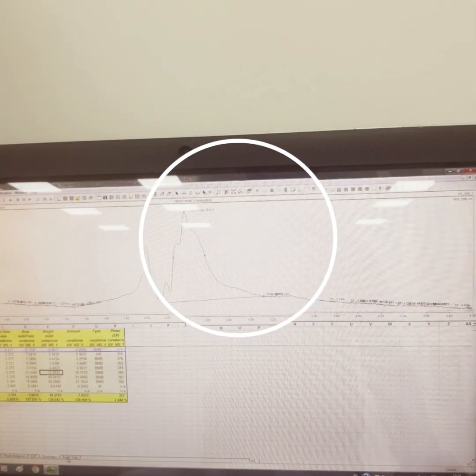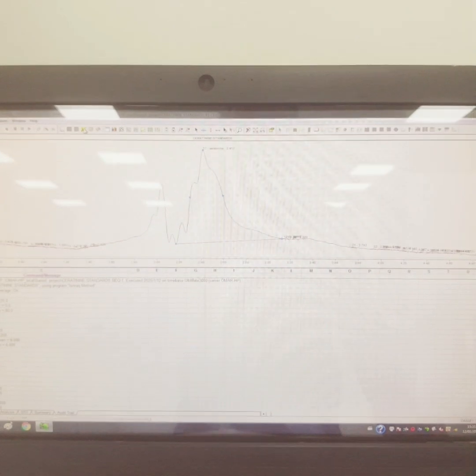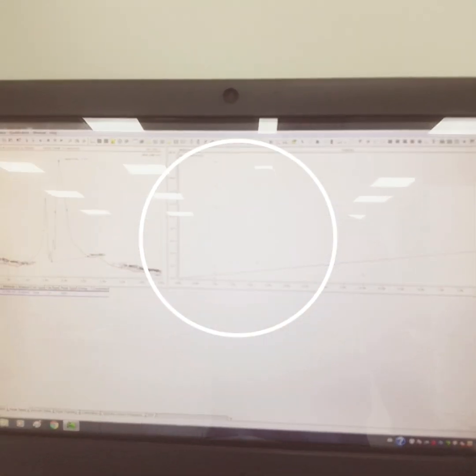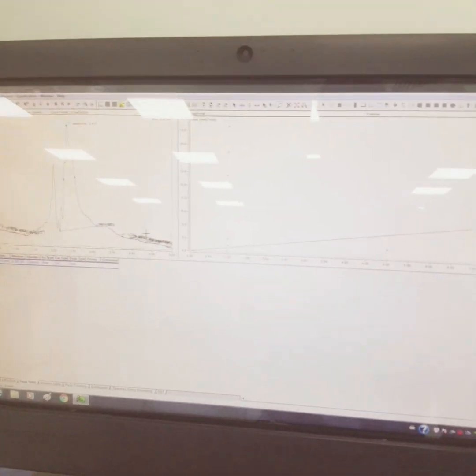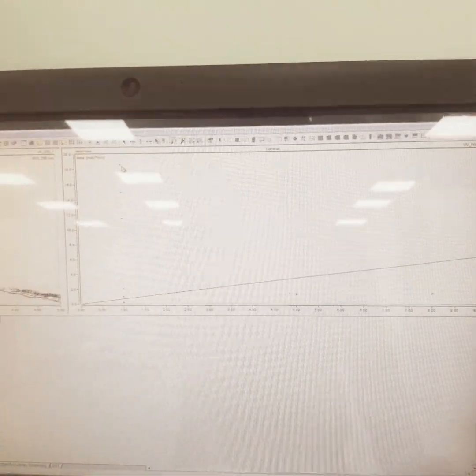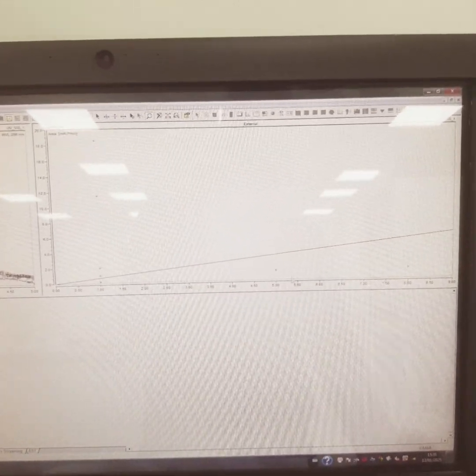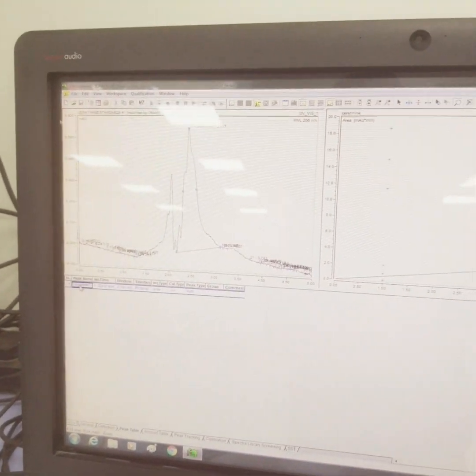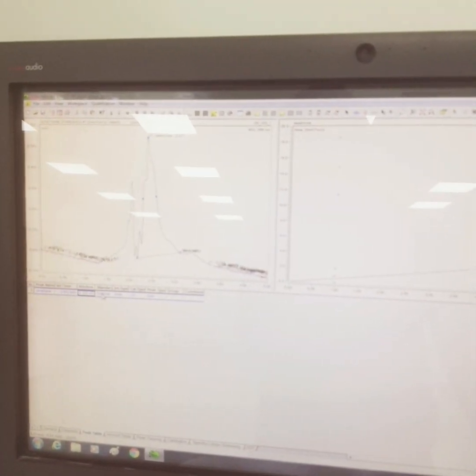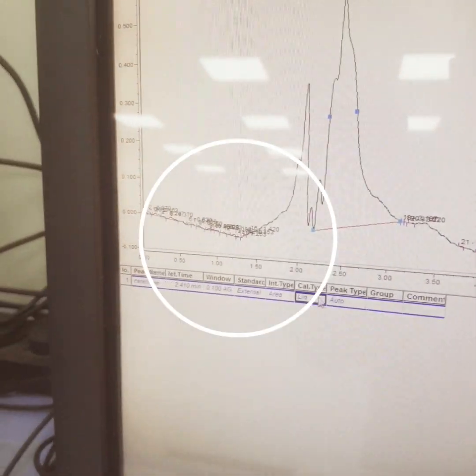this is our audit trail. It's giving you all the methods. And then if you click here on the Q&T editor, this is our peak, and then this is showing you the points of the calibration window, and this one is basically pertaining to the first UV, second simultaneous. This is our desired points, okay. And you can name your retention time, you can name your peak, window, standard, and then area, and calibration type is linear, okay, and peak type is auto.